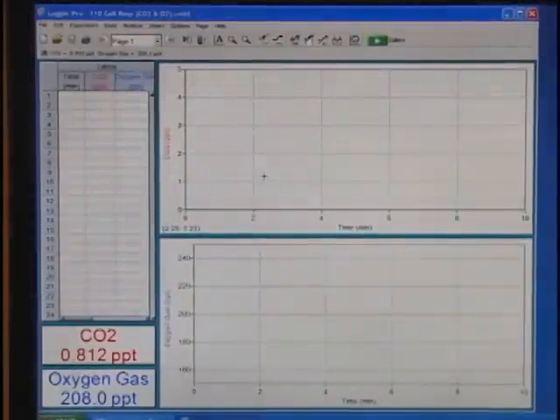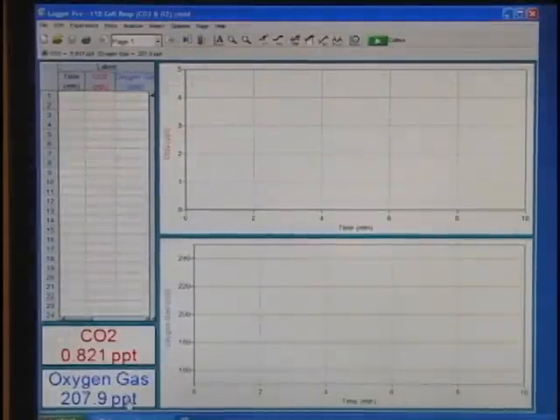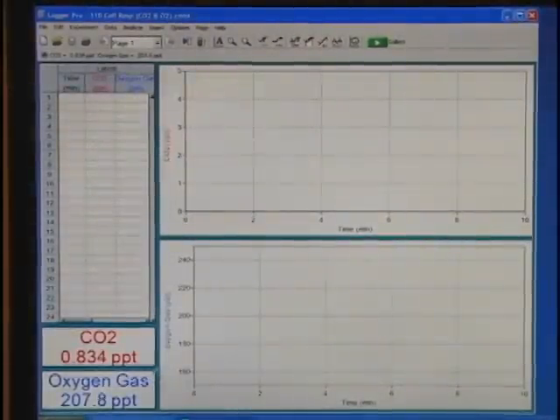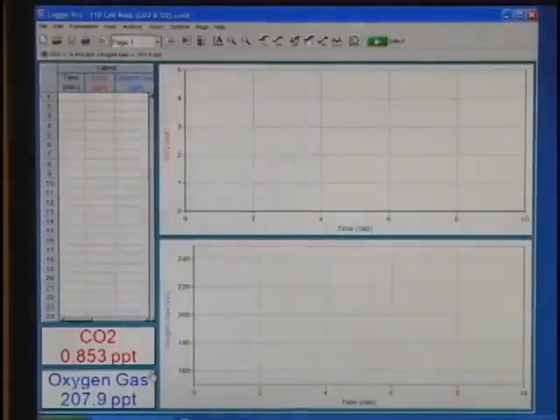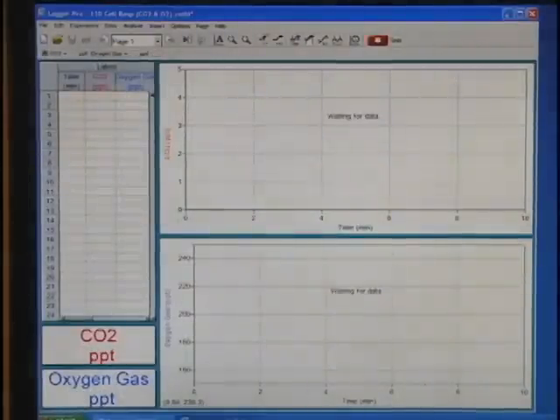Notice that the units have now been reset to parts per thousand for both the CO2 and oxygen gas sensors. The CO2 gas sensor has a 90-second warm-up period, so wait at least 90 seconds to begin data collection. After 90 seconds, watch the CO2 levels to see that they're starting to increase. If they are, start data collection.